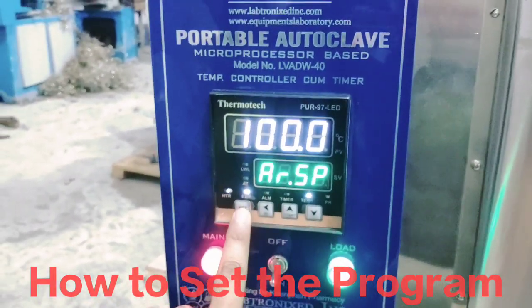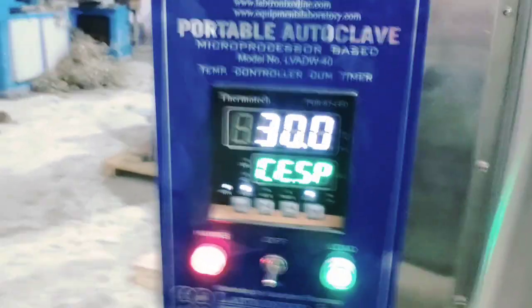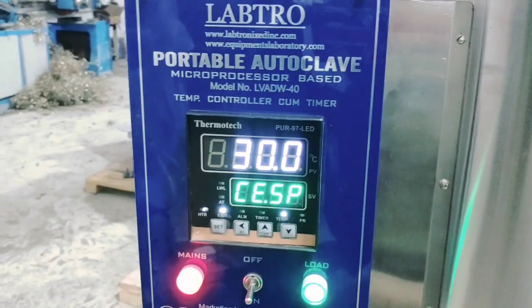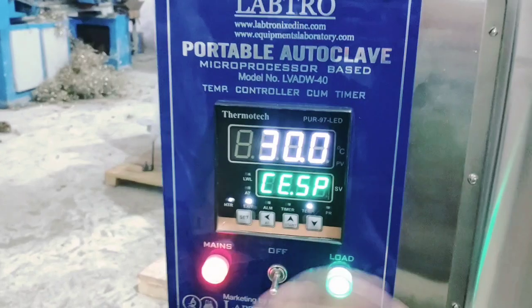Okay, then just set — don't change any program, only change the temperature and sterilizing time. Okay, and automatically the programming exists — don't change it, it comes automatically.